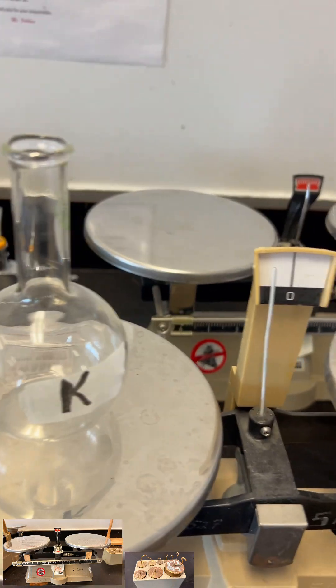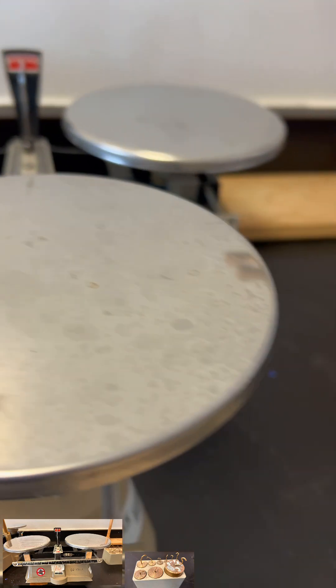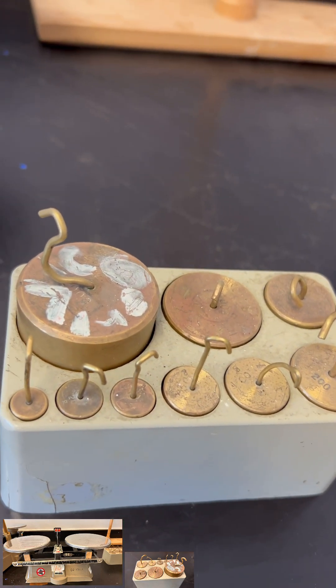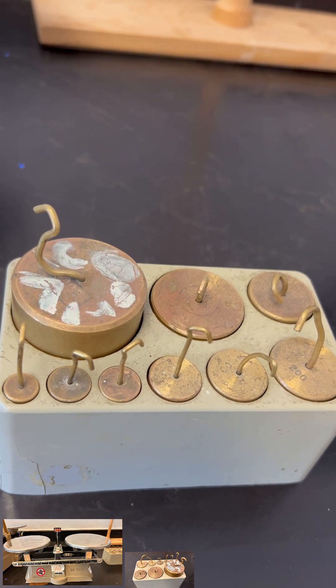For objects like this Florence flask or beaker, you need to get the set of weights here. Okay, there you go Falcons, your turn.